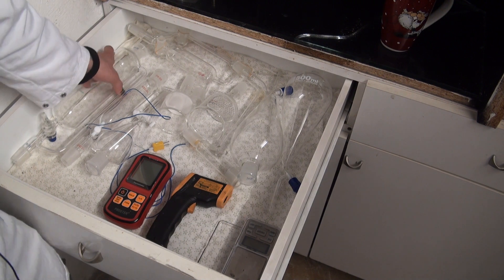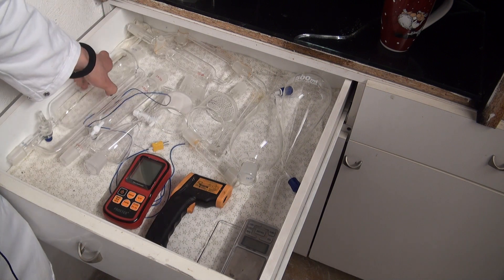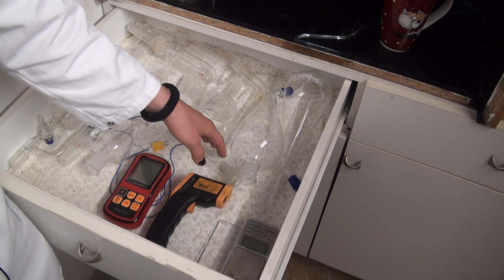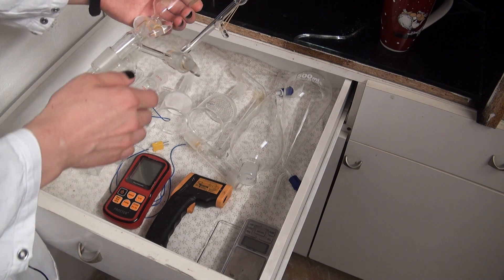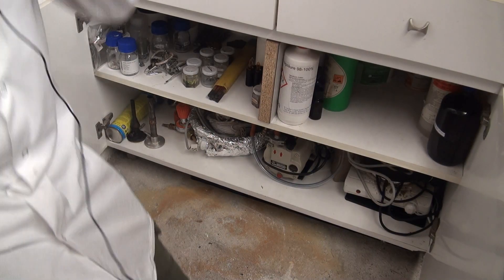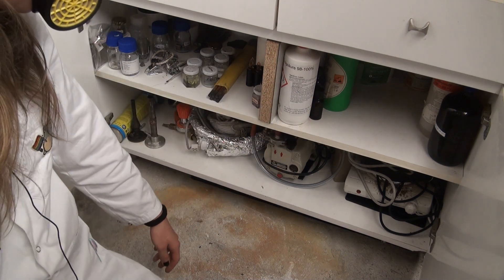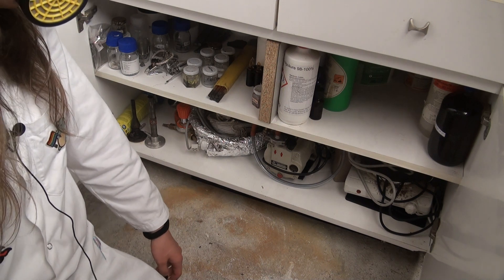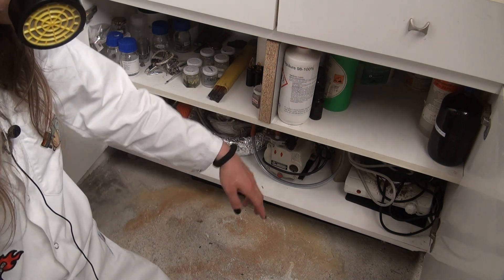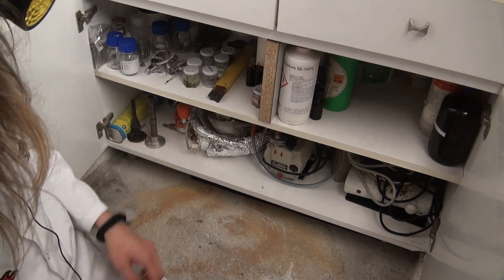Here I have a lot more goodies — for example, a 500 milliliter pressure equalizing addition funnel, small addition funnel, separatory funnels, vacuum filters, adapters, and this very nice vacuum distillation apparatus. In here I mostly store my inorganic acids, but also some organic ones like acetic acid, formic acid, etc. Down there I also have nitric acid, concentrated sulfuric acid, hydrochloric acid, hydrofluoric acid, and hydrobromic acid.